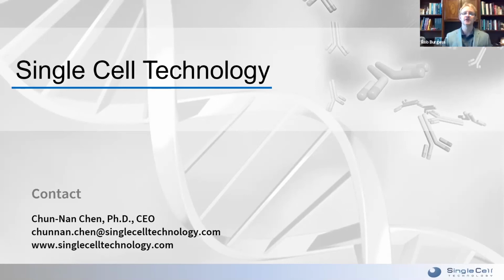And Moen Shayagania asks, does increasing your specificity come at a cost of reducing your sensitivity? I don't quite get that question here. When we look at the specificity, we obviously interrogate the antibody at different concentrations of the antigen.